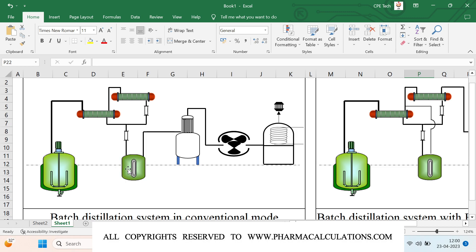The vacuum enters into the receiver, and from this distillate collection receiver, the vacuum comes into the condenser simultaneously. Then the vacuum enters into the reactor, or is generated inside the reactor, through the vapor line. During the course of distillation, under vacuum, vapor is generated under reduced pressure — that is, below atmospheric conditions — and the vacuum flows through this vapor line. Initially it gets condensed in the primary condenser.